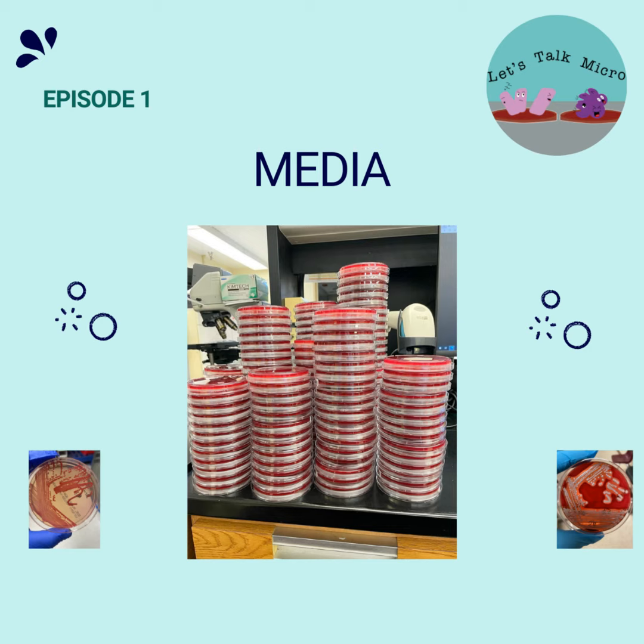Another great example of selective agar is PEA, phenyl ethyl alcohol agar. It is used for the selection of aerobic gram-positive cocci and bacilli. That is not to say that other organisms will not grow, but maybe somewhere down the line we'll talk about that. But these are two great examples. They are included in your basic battery of cultures, and I will talk more about this. But definitely blood, PEA, MacConkey.